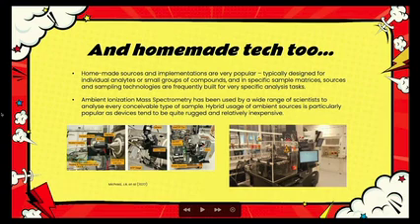So, laser systems and such make it a particularly good way of getting a sample volatilized and then perhaps partially ionized into a stream of gaseous molecule that can then be taken up through the source itself, ionized, and brought into the mass spectrometer.